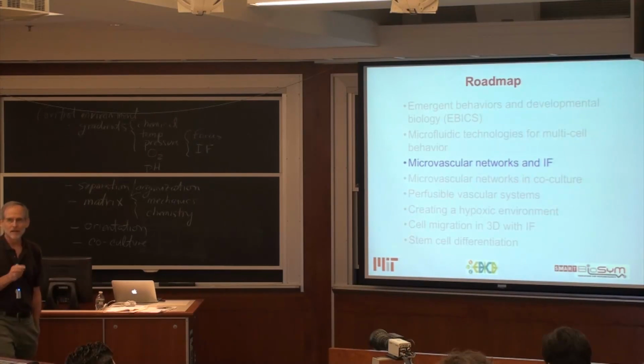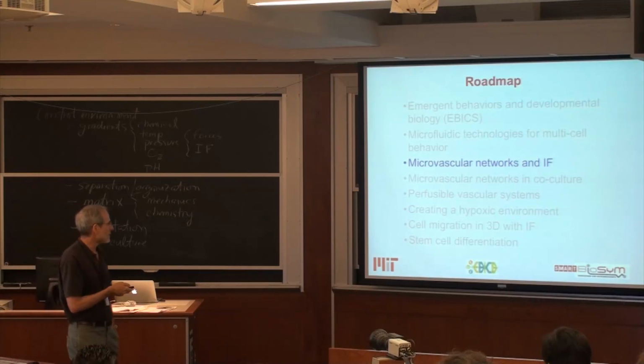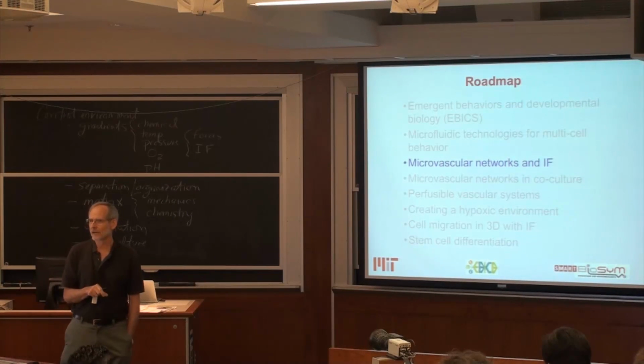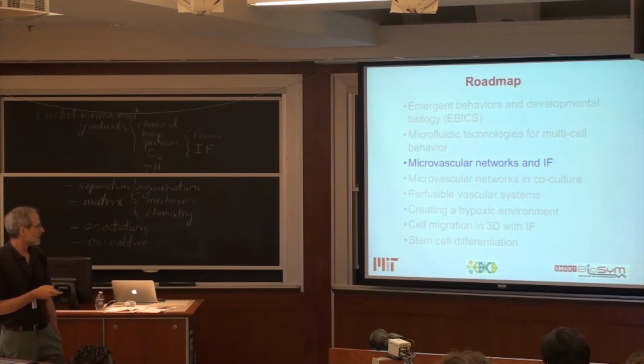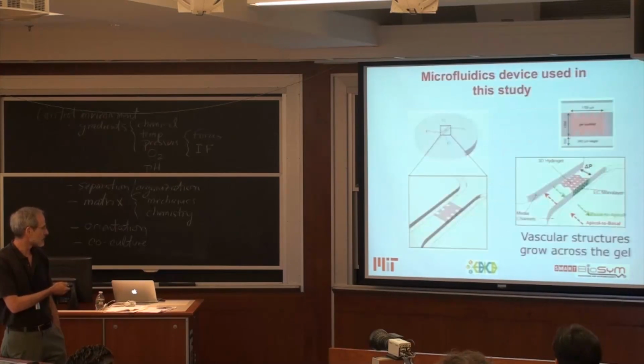So focusing in on microvascular networks. What I'm first going to tell you a little bit about is some work that a student, Vernella Vickerman, in our lab did, where we're looking at the interaction between interstitial flow and the formation of vascular networks.